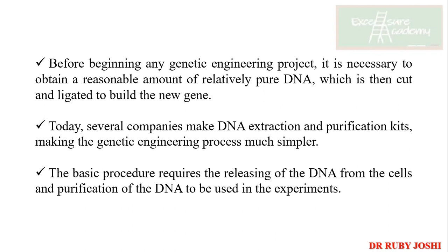It's okay. Initially in BSc, if you would have done it, maybe the conventional method was given, where you extract from a plant, because from a plant you can get a huge amount of DNA. We have isolated DNA and RNA though, like the Orcinol method.